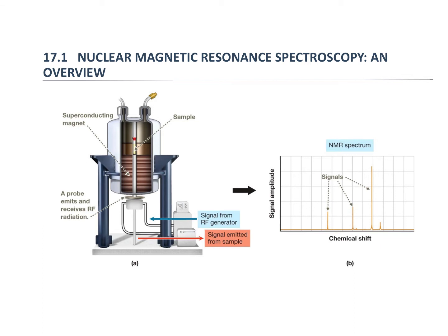These are very expensive instruments. They are starting to develop some desktop NMRs that are about $40,000. But NMRs themselves can be up into the millions of dollars.